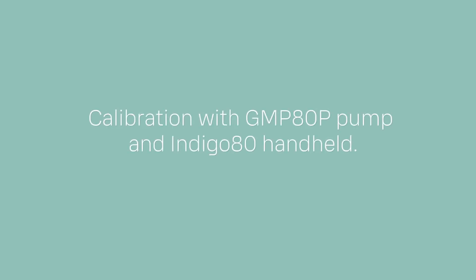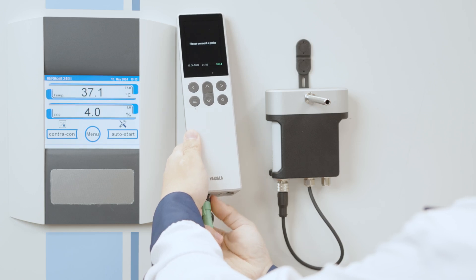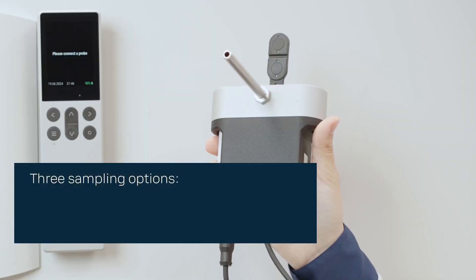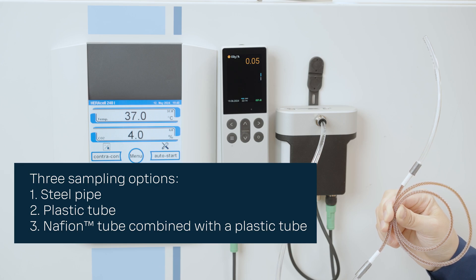Another way of calibrating on-site is with the help of the GMP 80P pump and IndiCo 80 handheld. First, you need to collect a sample. It's convenient to take a sample using the IndiCo 80 handheld and GMP 80P pump as the sample can be taken through a sampling port. Also, keeping the incubator door closed speeds up the calibration. There are three different sampling options: the first is to use a steel pipe, the second is to use a plastic tube, and the third is to use a Nafion tube combined with a plastic tube.